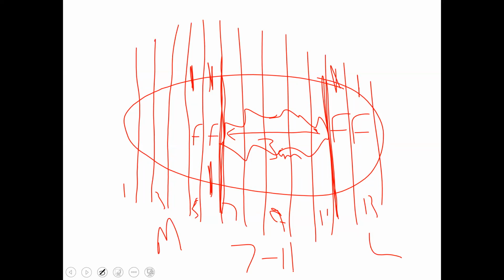Can you please go back and give me additional sections of slices 1, 2, 4, 13, 14, et cetera? Because maybe the tumor is bigger than we initially thought. Maybe instead of a 3 centimeter tumor, we're dealing with a 6 centimeter tumor, which of course would have important implications on how the patient's handled. So that's the purpose of putting in the flank sections.